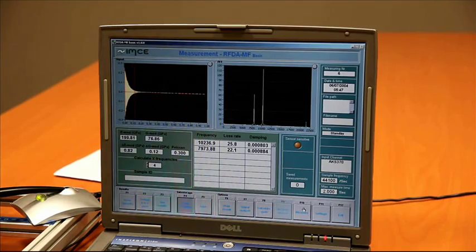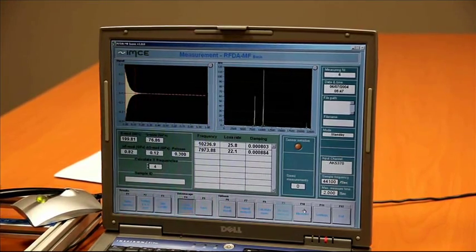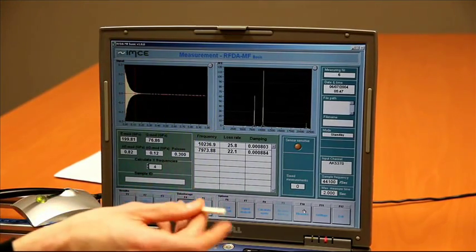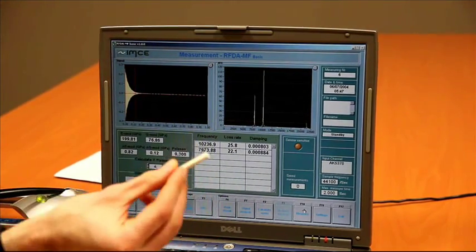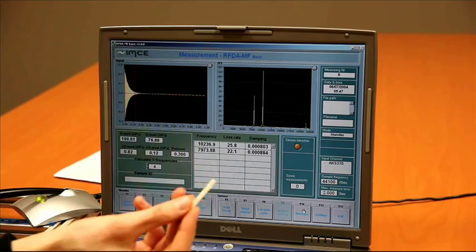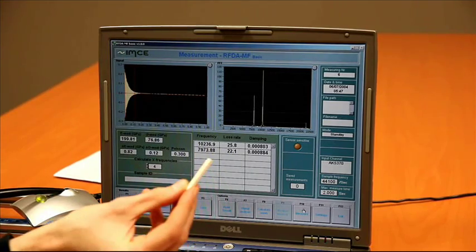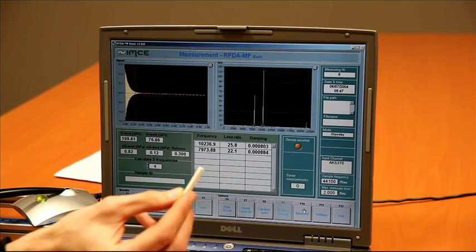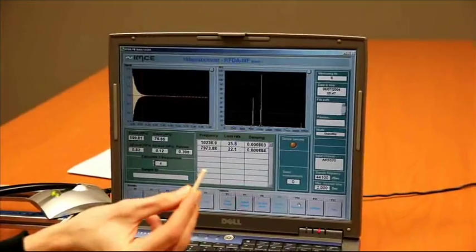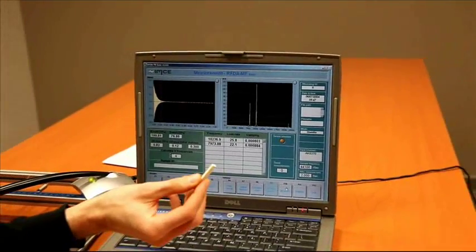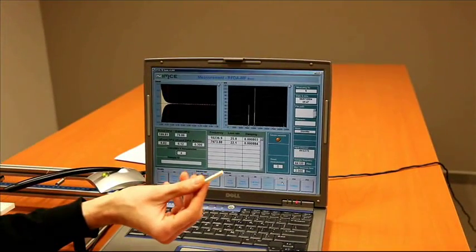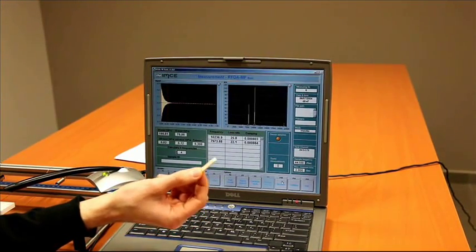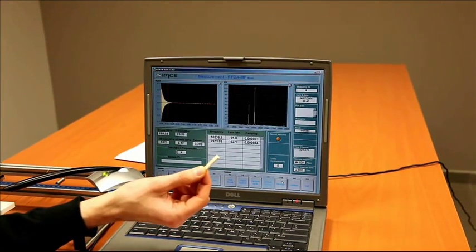Now, let's have a look at some other samples which we can measure. This is another rectangular bar, a little bit smaller than the one we have measured. The smallest we can measure is a rectangular bar like this with a length of about 2 centimeters.